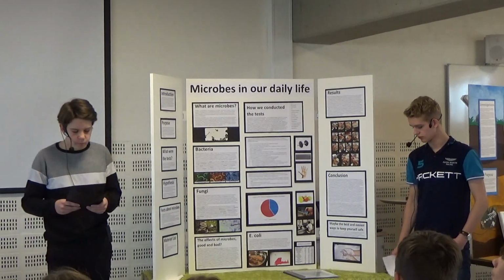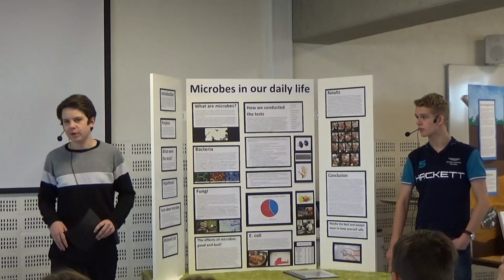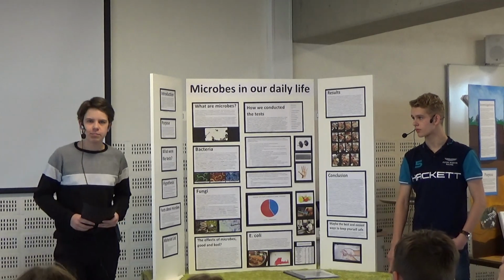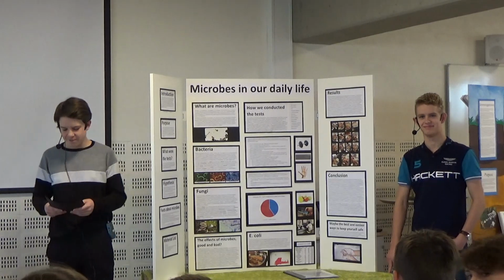And now when we heard a little about microbes, let's talk about our experiment and how we did it. We started the test by making the agar plates. That part our wonderful teacher Mihaela helped us with.